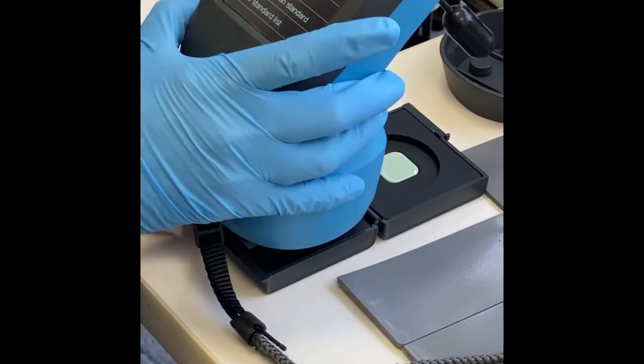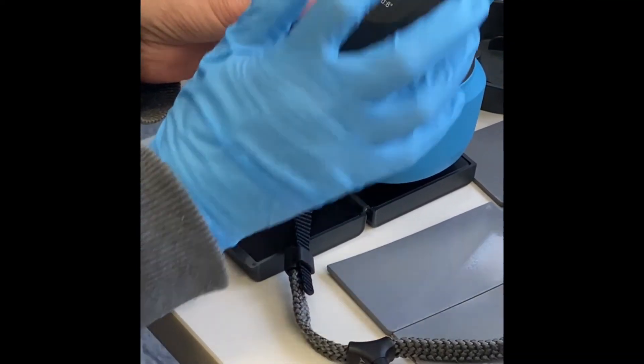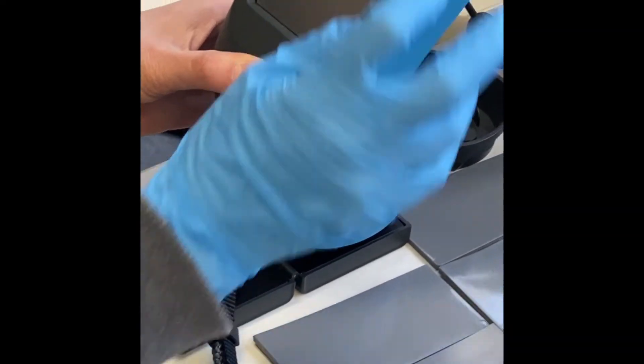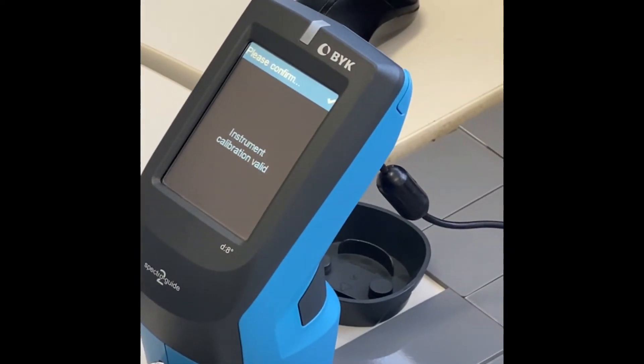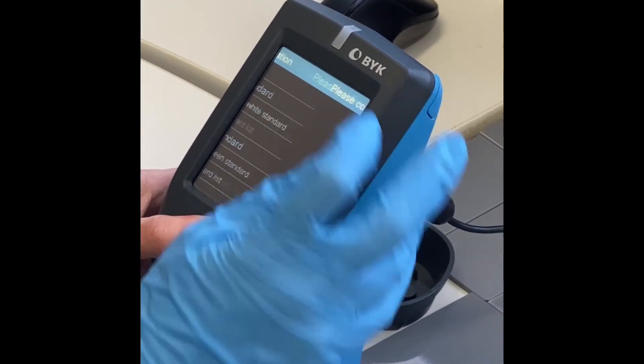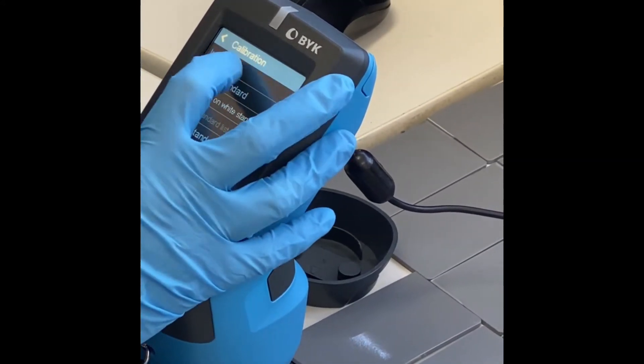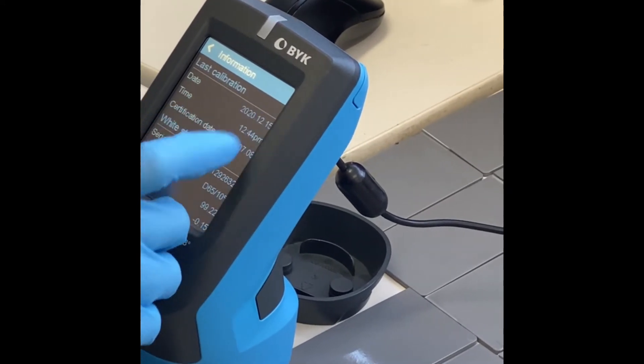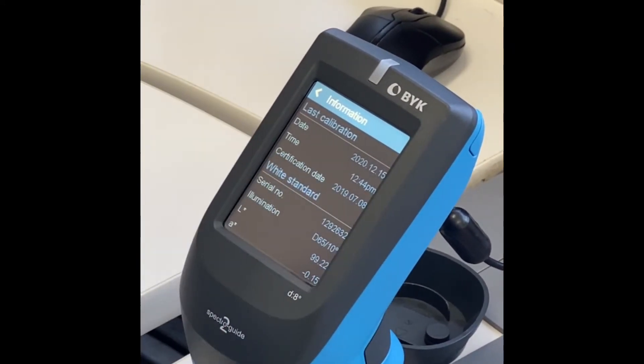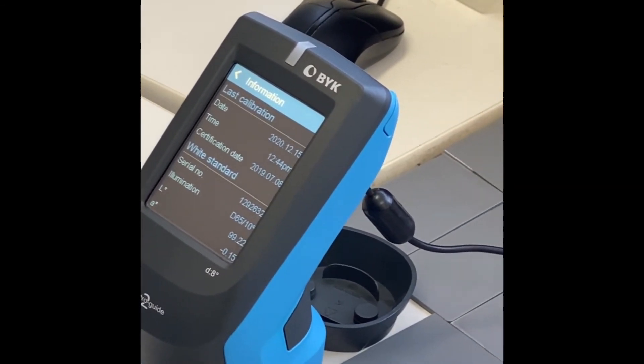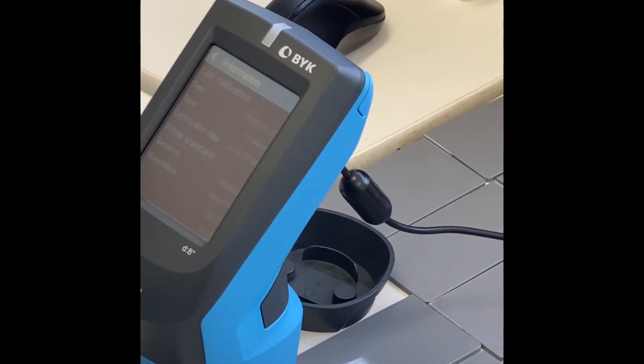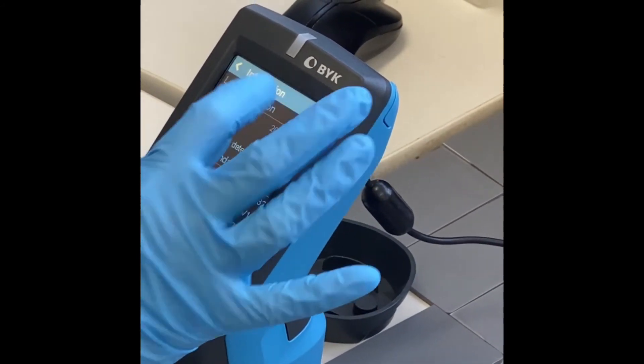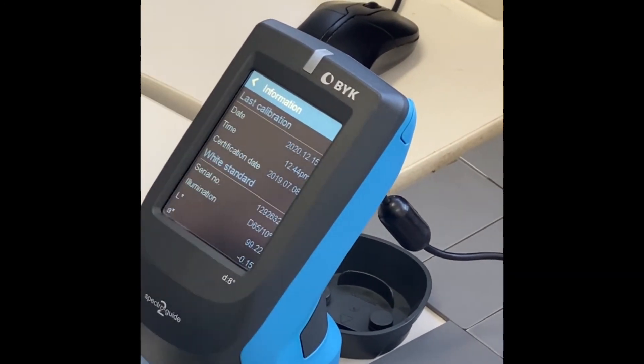And then I do the check on green standard, and it says it's valid. If you want to double check you can go to the information and it tells you the date and the time. Okay, so there's a log of that? Yes. So you can go backward and find out. If I wanted to see if it was done yesterday? I'm not sure about that but it does tell you when it was calibrated that day.